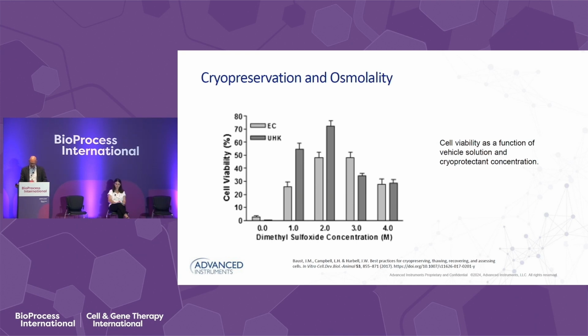So in this slide, we're going to look at cell viability as a function of vehicle solution and cryoprotectant. Cells undergoing cryopreservation pass through a period of hypothermia before, during, and after the freezing process. So the role of the vehicle solution for the CPA influences the outcome of cryopreservation and needs to be considered when setting up a cryopreservation scheme.